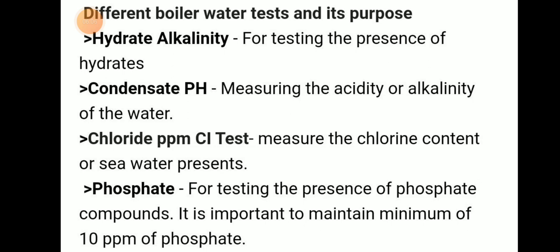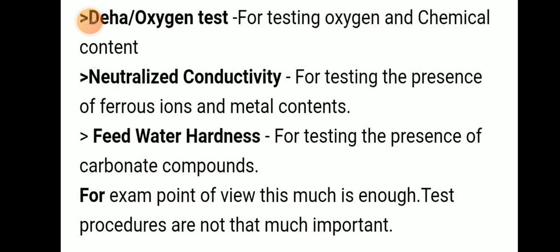Then DEHA or oxygen test, for testing the oxygen and chemical compound. Then neutralized conductivity, for testing the presence of ferrous ions and metal conducts. Then feed water hardness, for testing the presence of carbonate compounds. From the exam point of view, this is enough. So this much we have mentioned here.